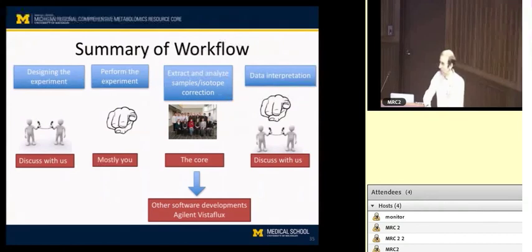It is certainly possible to use a tracer and perform untargeted metabolomics. You'll get data, but the challenge of untargeted metabolomics is bad enough in trying to identify unknown metabolites or features of interest that may not be identified with a metabolite name at the outset, without trying to add the complexity of a whole bunch of isotopes and a whole bunch of other tracers. Although there are occasions when that's what you need to do, I would recommend for most purposes beginning with this as a targeted workflow. If you're going to do untargeted analysis, do that without a tracer.